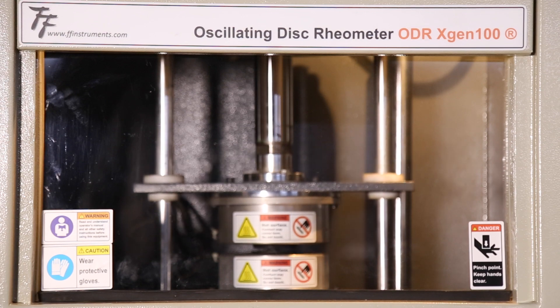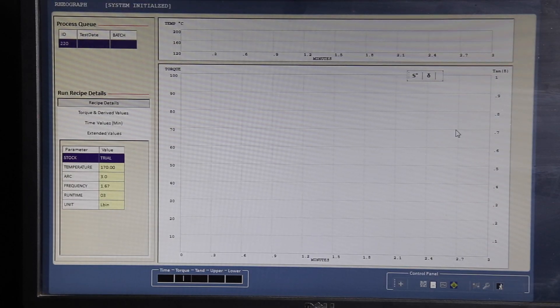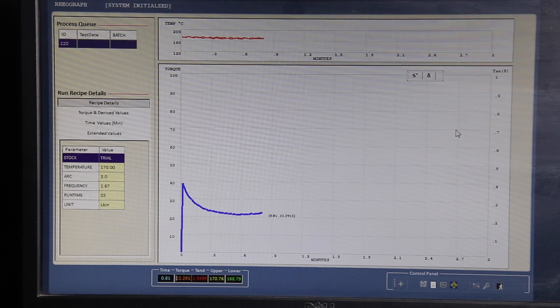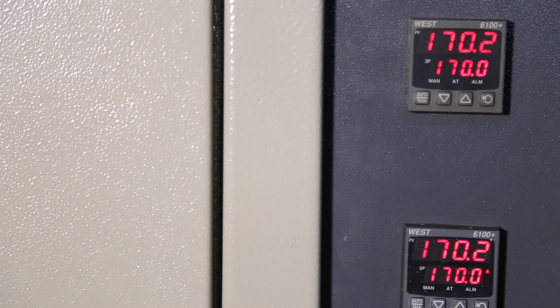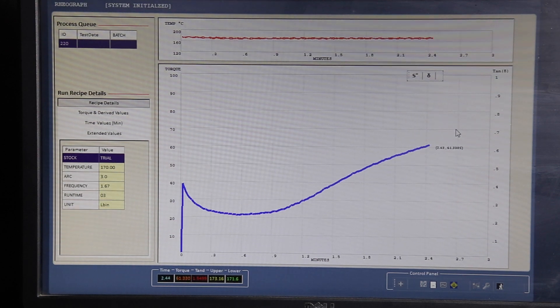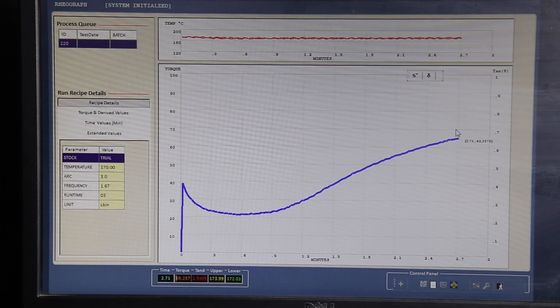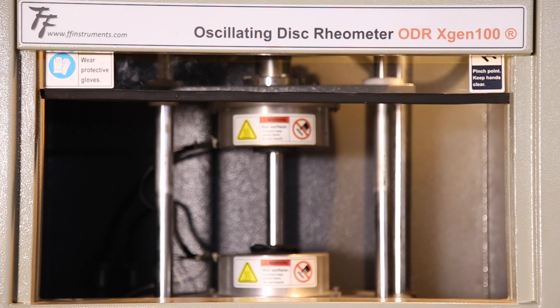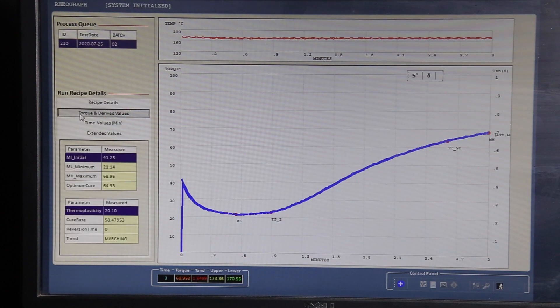A test piece is placed on the rotor and the test is started by pressing the start button on the monitor. As the sample heats up, it undergoes curing. This increase in stiffness or cure is displayed on the screen as a torque versus time graph. At the end of the test, the software calculates the results and displays them on the screen.